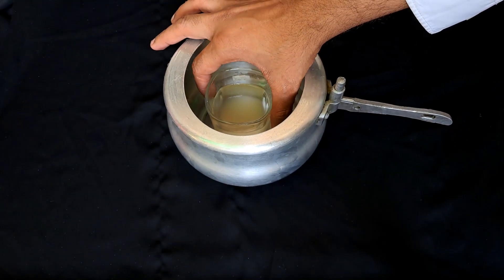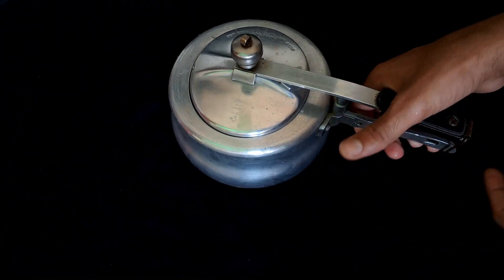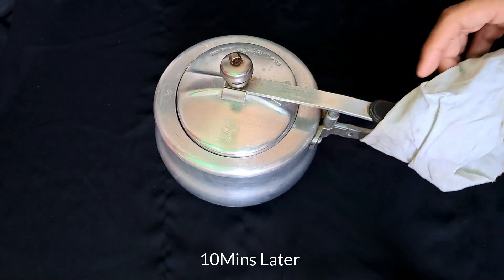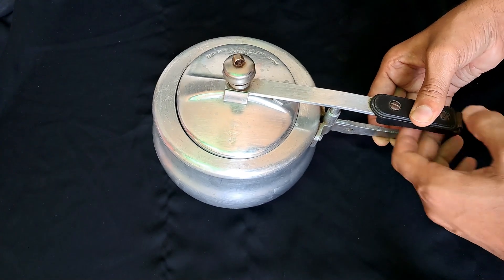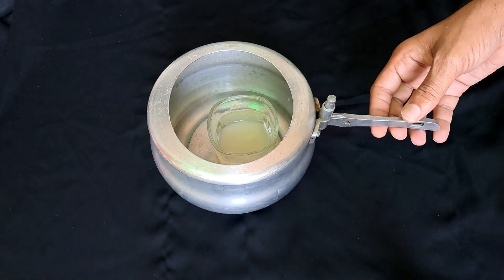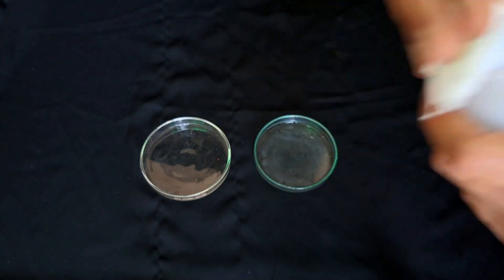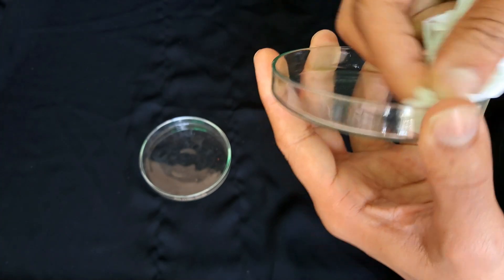Now I will sterilize the solution by autoclave. After 10 minutes, I took out the solution, and before pouring it into the dishes, I cleaned them with rubbing alcohol to avoid any contamination.